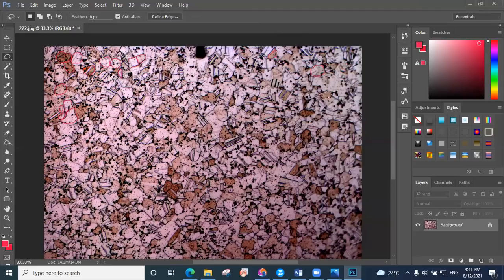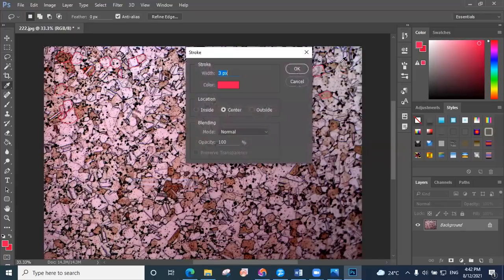It's okay. You can choose everywhere or just go through one direction and go through until you cover all the microstructure. First, here I can do, for example, from this direction and cover all the places and all the picture and circle everywhere or every clear boundary of the grains, because they are too much.